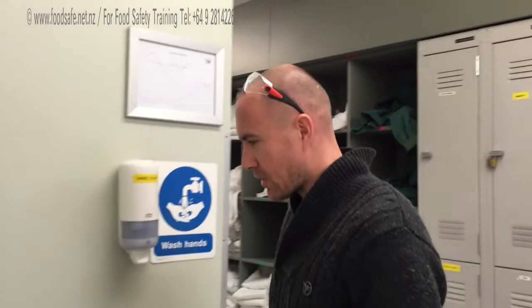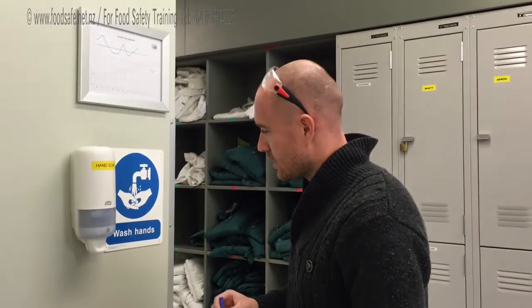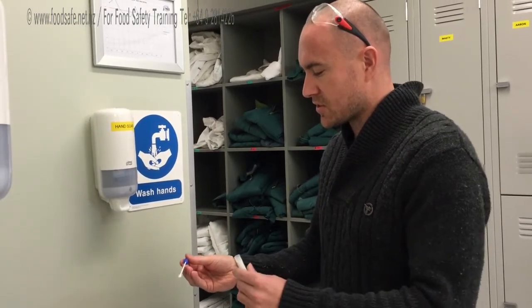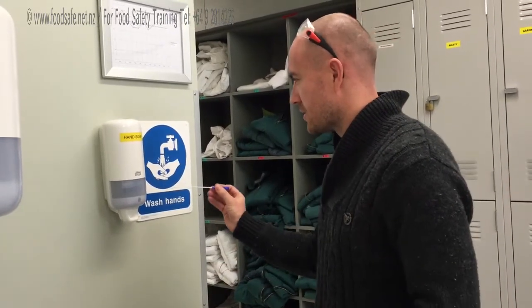I'll start by doing something around the hand soap — I'll just pick an area. So you just pull it out, try and not touch the sides. This is just new, so you know if it's been used because the blue bit will be pushed in. I'll select a bit of an area around the hand soap there.